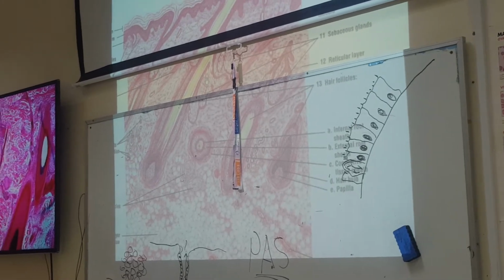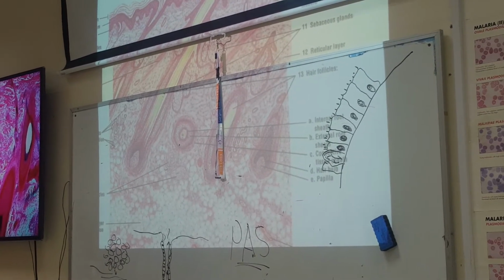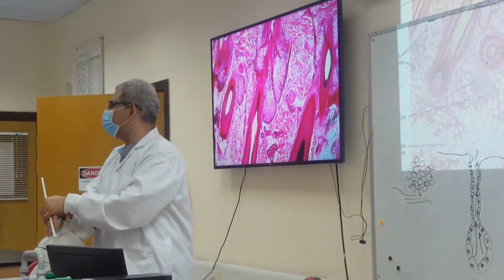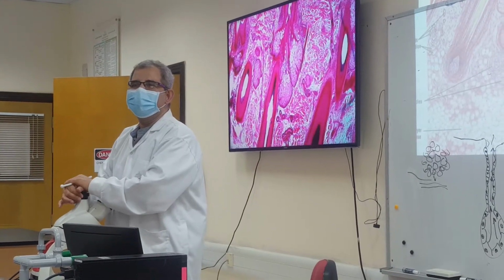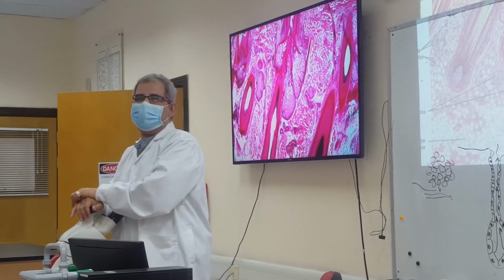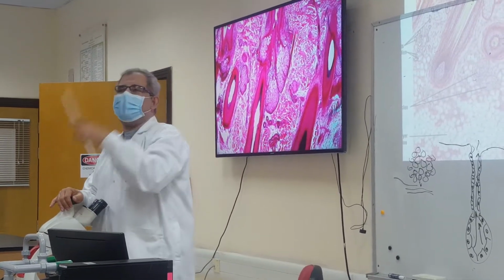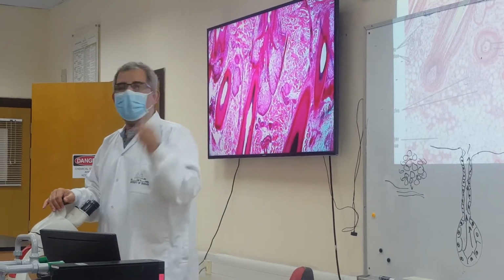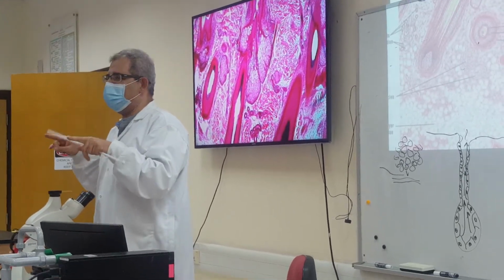Okay? One more question, what's the function of sebaceous glands? For sure secretion. For what? Definitely secretion. It's a gland, so it will do secretion. Sweat? No, we talked about sweating glands. These ones are associated with hair. Looks like today I am answering all the questions myself. I'll leave you this question as an answer for your theory.